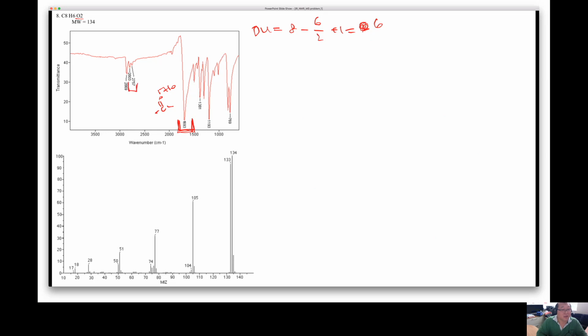That one is clearly showing that we have an aldehyde, right? This aldehyde hydrogen is showing that, and then this carbonyl of the aldehyde is conjugated. It doesn't necessarily have to be a double bond. It could be benzene too. But anyways, it's next to an unsaturated bond. That's why it came down.